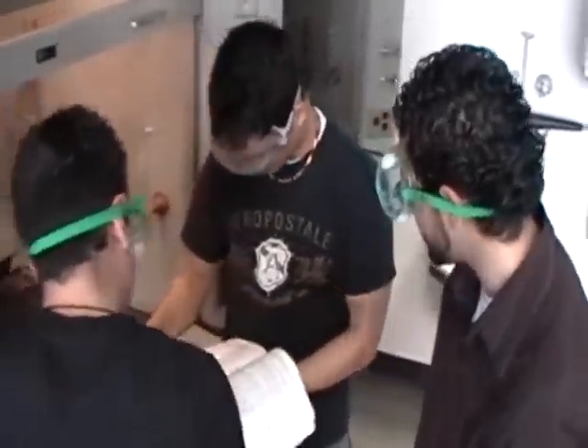Hey guys, what are you guys doing? Hey, what's up Mike? Yeah, we're doing reflux. Do you know what that is? Is it like when you look in the mirror and you see your face, like a reflection?